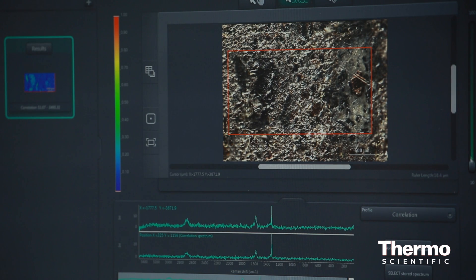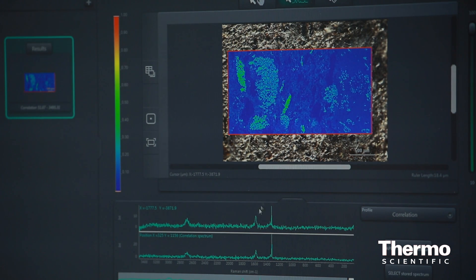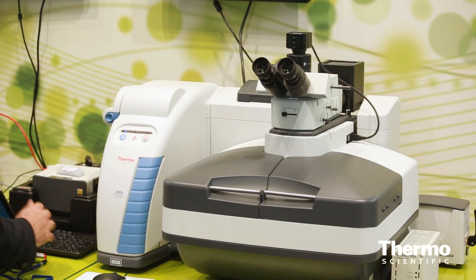You will no longer look at spectra, but you will start to look at images, so you will get information much more quickly and much more easily. This instrument is really for non-Raman experts as well — it is designed to bring Raman to all people and to all industries.